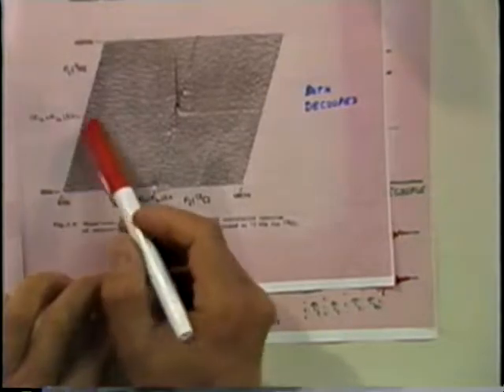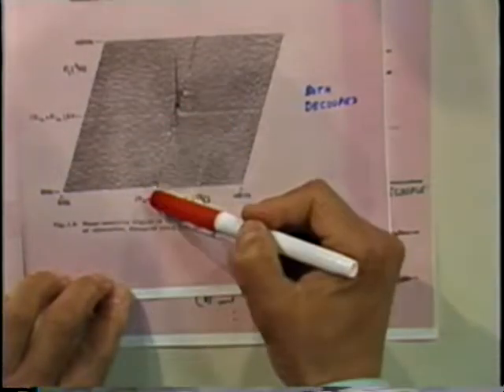Okay, and one can get a decoupled spectrum, as I showed you here, which is then a single frequency telling us that on the omega-1 axis, that's the proton frequency, and on the omega-2 axis, that's the carbon frequency of that particular carbon. And you can immediately see its utility, and it is a very widely used experiment. And you can see, for example, an example that has been given to you.